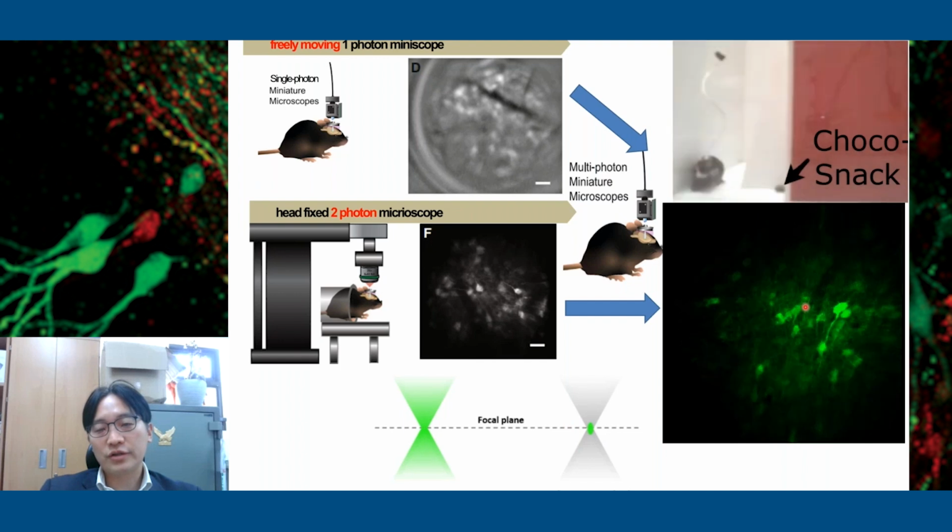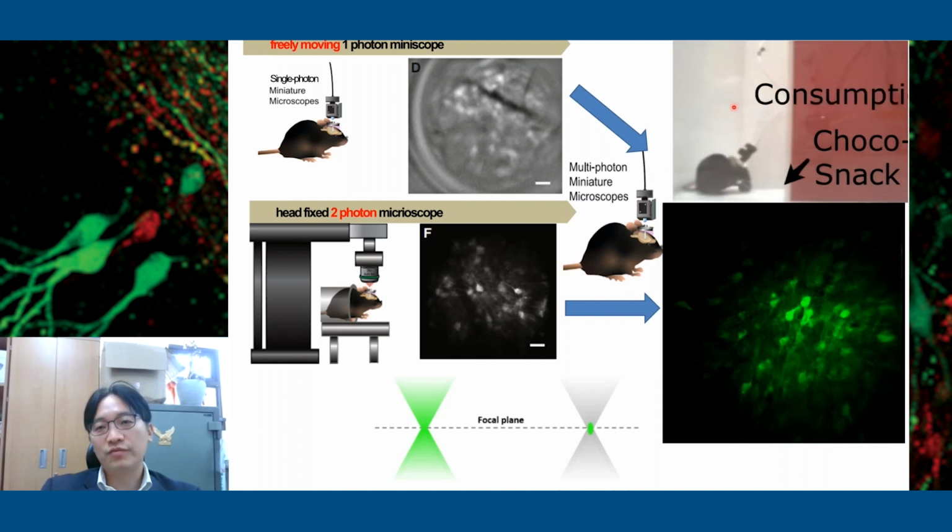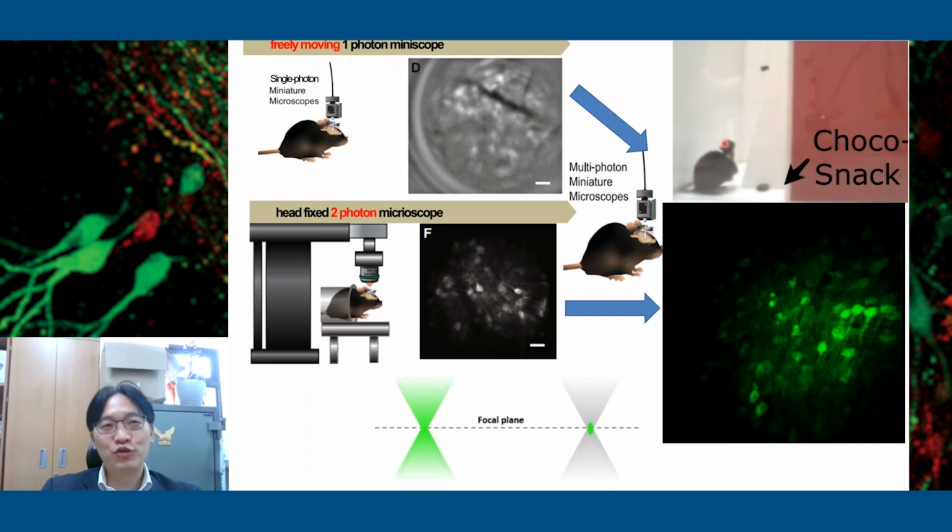But Bruker and other companies are making new devices so we can do this high spatial resolution 2-photon imaging in a freely moving design. So please wait for these new techniques to be more widely available.